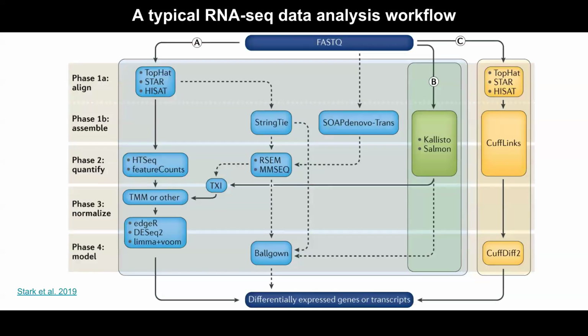Okay. So what does the workflow look like? This is a very biased view of the workflow because it has all the names of these tools, some of which you will eventually start to use, once you get your FASTQ data from here.